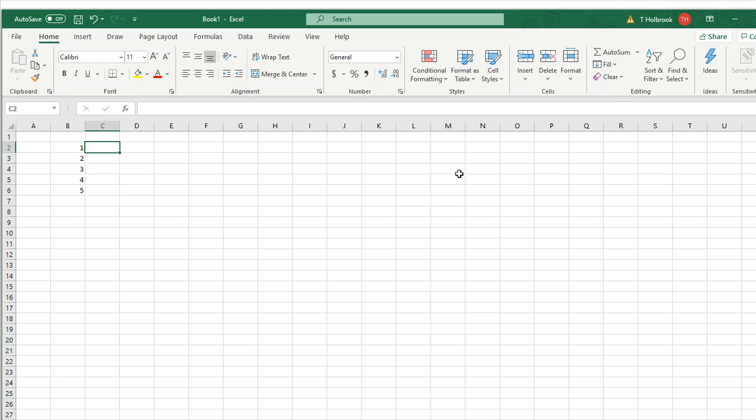Next, each one of those we had a mass for. Let's say that that 1 mil addition was 0.5. I'm just going to keep it easy for you, 0.5. And then I added another mil to bring me a total of 2, and that weighed 1. And then the next addition weighed 1.5, and the next one weighed 2, and the next one weighed 2.5. Again, I'm keeping it easy.